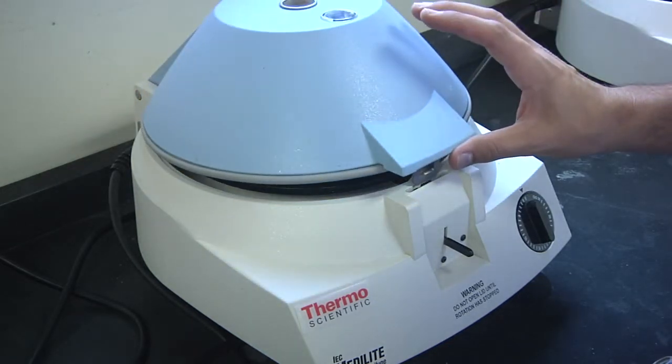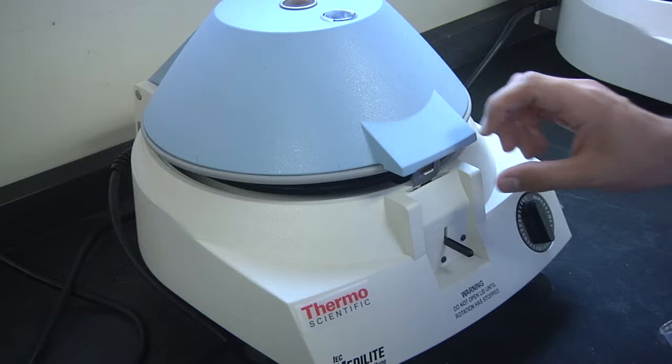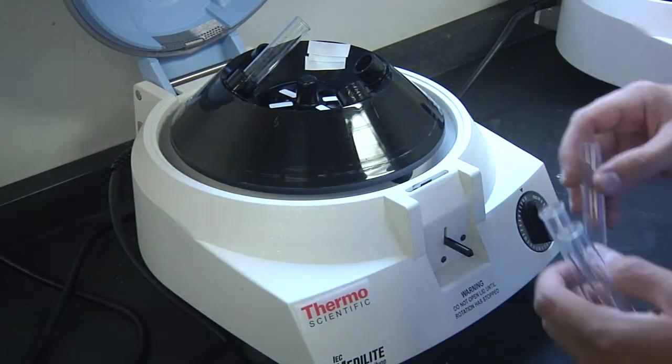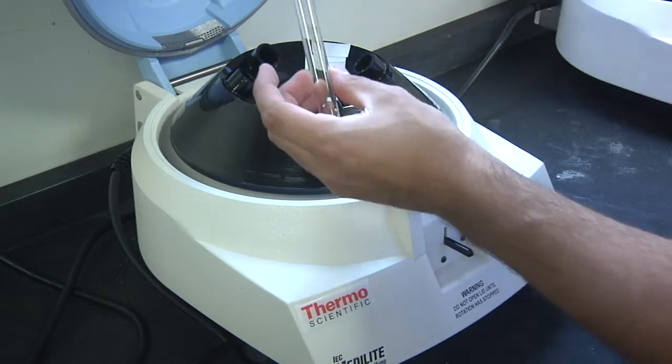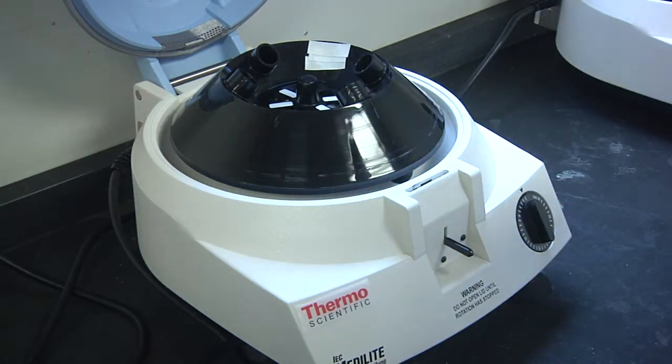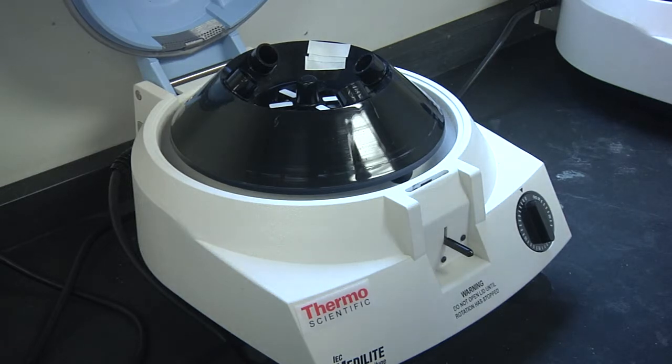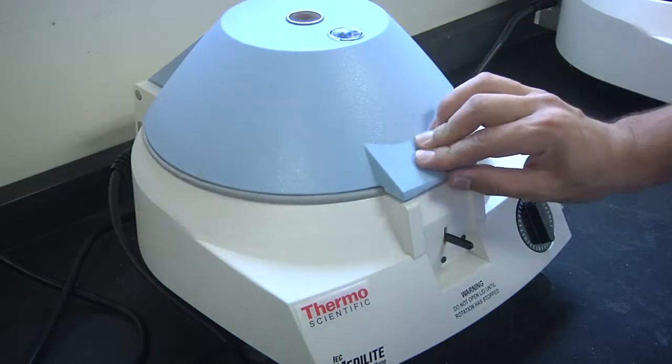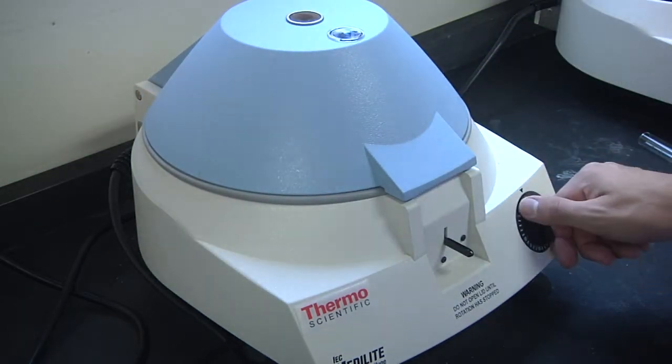So what we have to do is we have to find smaller test tubes. Here I have some smaller test tubes. I will transfer the liquids into these smaller test tubes and put them back into the centrifuge.